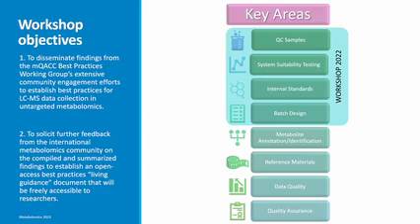Now the objectives of what we're going to get into today, to put it in the context of the bigger picture. We are here to disseminate our findings of the best practices working group. We have been engaging with the community for the last few years, and we have been gathering information related to best practices for LC-MS-based metabolomics. And we've been doing this according to 8 key areas.